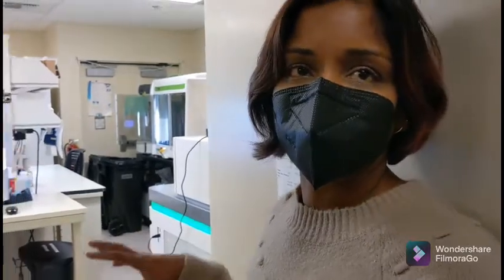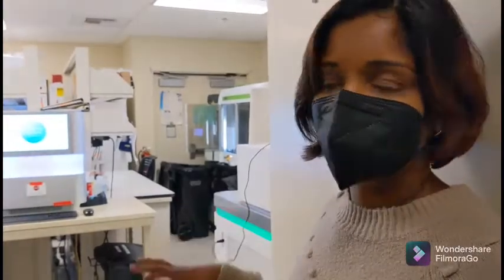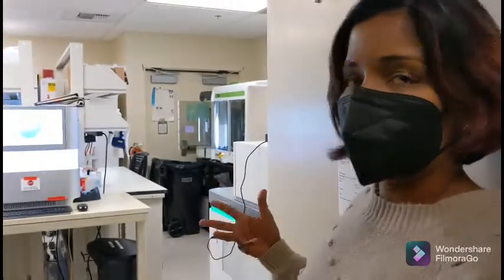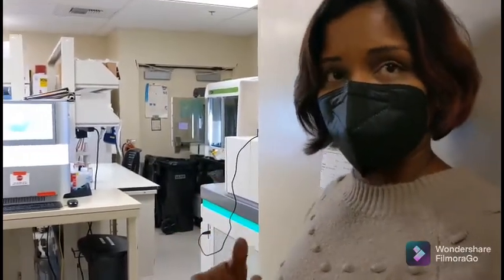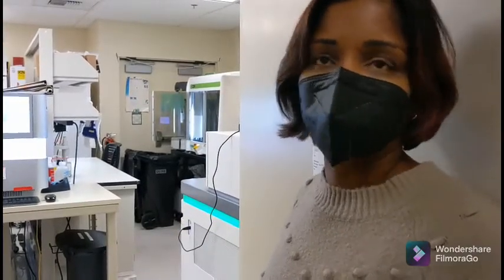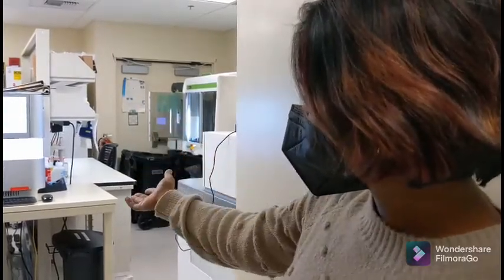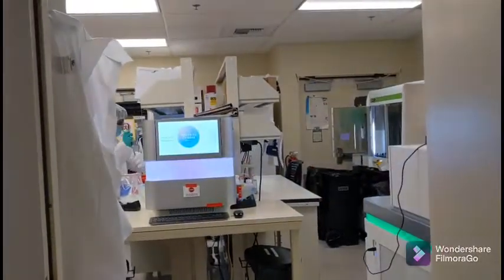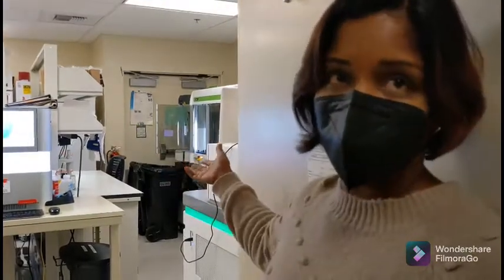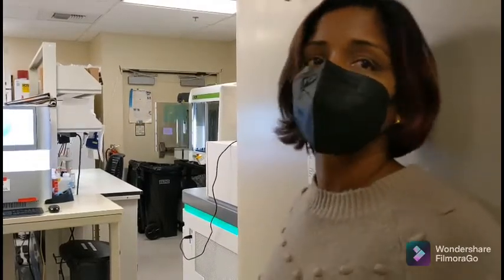Yeah, so what you're seeing is the very end of our sequencing operation here. This is where the samples that are positive for COVID-19 come up and they get sequenced, which is we're determining the whole genome sequence of the virus in that sample to determine whether or not there's Omicron or Delta or any other variant in that sample. And what you're seeing here are our sequencing instruments, and that's one of our research scientists who's preparing sequencing libraries that will ultimately go on one of these instruments that will generate the data that we analyze to get that result about which variant is in the sample.